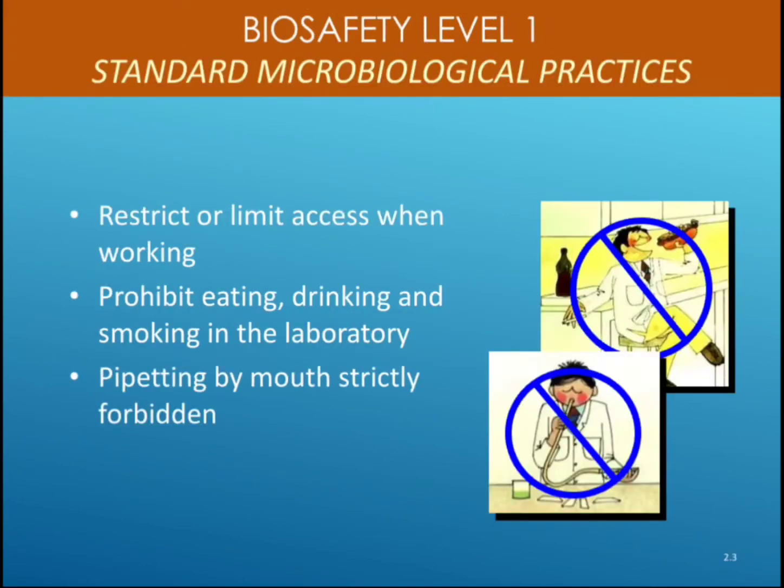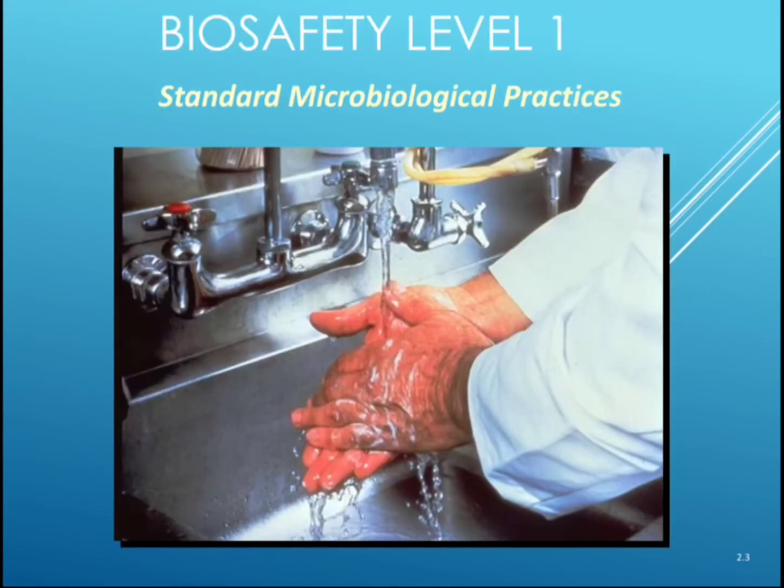Then biosafety level 1. Okay, these are the standard microbiological practices which restrict or limit access when working, and prohibit eating, drinking and smoking in the laboratory. Pipetting by mouth is strictly forbidden in biosafety level 1. In biosafety level 1, this is the way you should wash the hands properly, using a proper disinfectant as well as soaps.